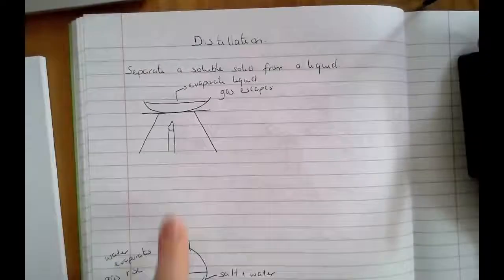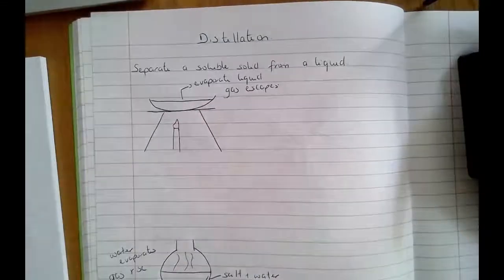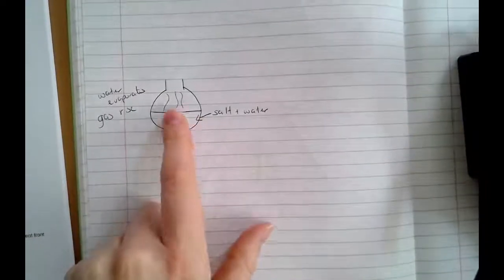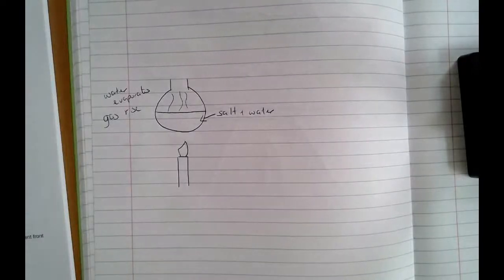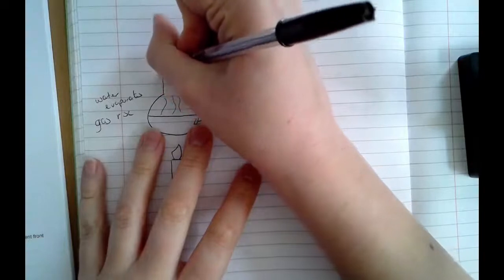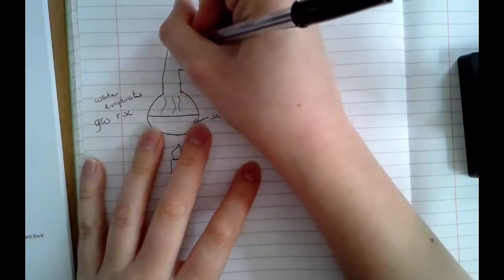This is all the same as crystallization so far, and in crystallization, once that hot gas rose up, it just escaped. What we want in this case is we don't want that hot gas to be able to escape. We want to be able to trap that hot gas. And not only do we want to trap it, but we want to go from a gas back to a liquid. So that's what we're going to do in distillation. My drawing skills aren't the best. We're going to have something that looks like this.